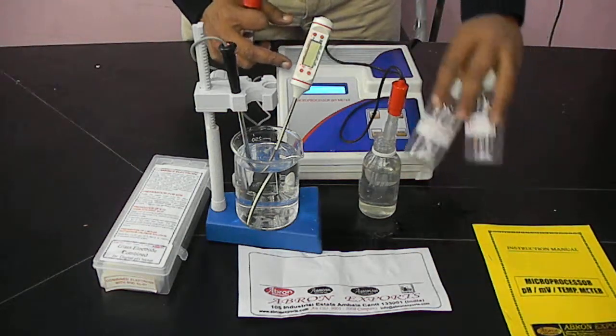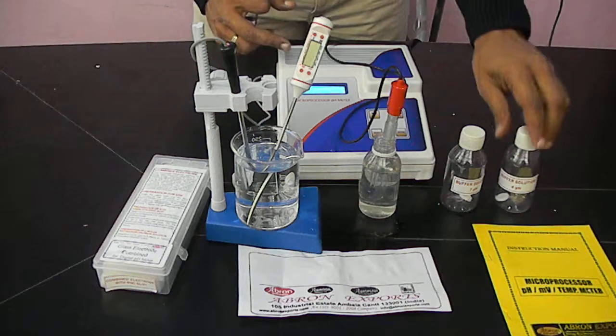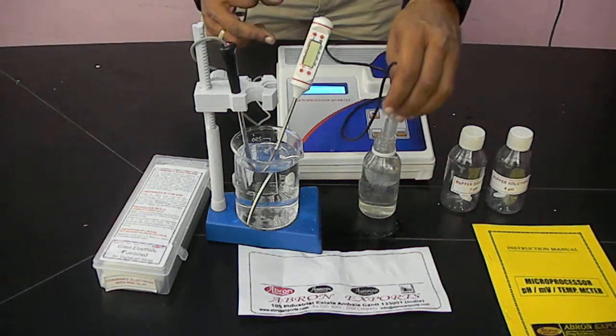We give two bottles of 7 and 4 pH. Use distilled water, 100 ml. Prepare a 100 ml solution with the 4 pH buffer we have already made.